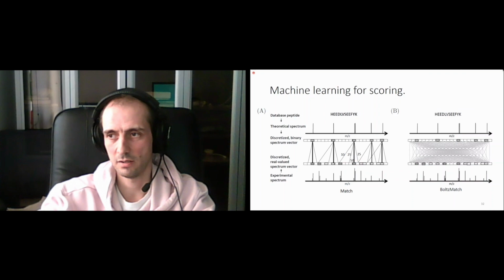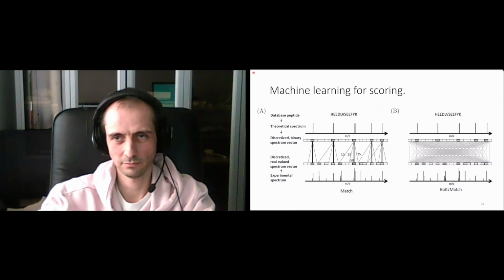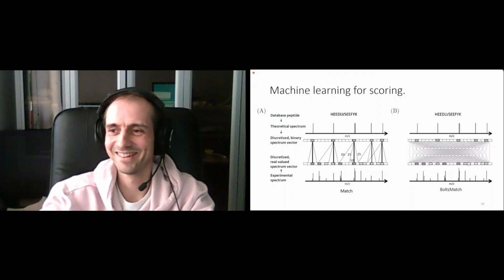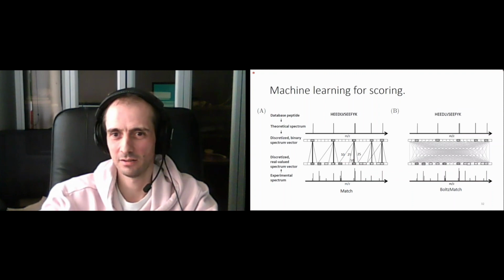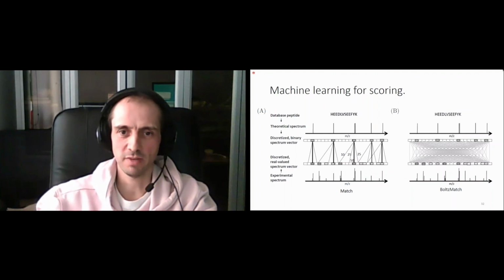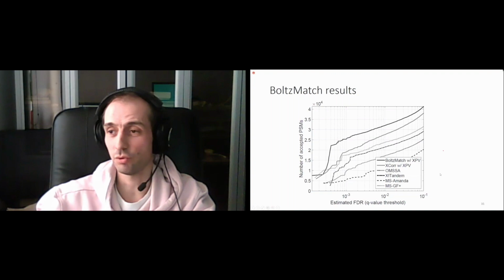That's sure. But I wanted to understand, okay, you show us some graphs and your method is clearly better, but that's what all people do. Now I want to know where are the catches, the little letters in the footnote. And so, okay, I said already 5 times. The footnote is that these other models, they work for all machines without training. No, okay. So if you use the old methods and then you are not using the proper instrument, you can still get a very poor performance.